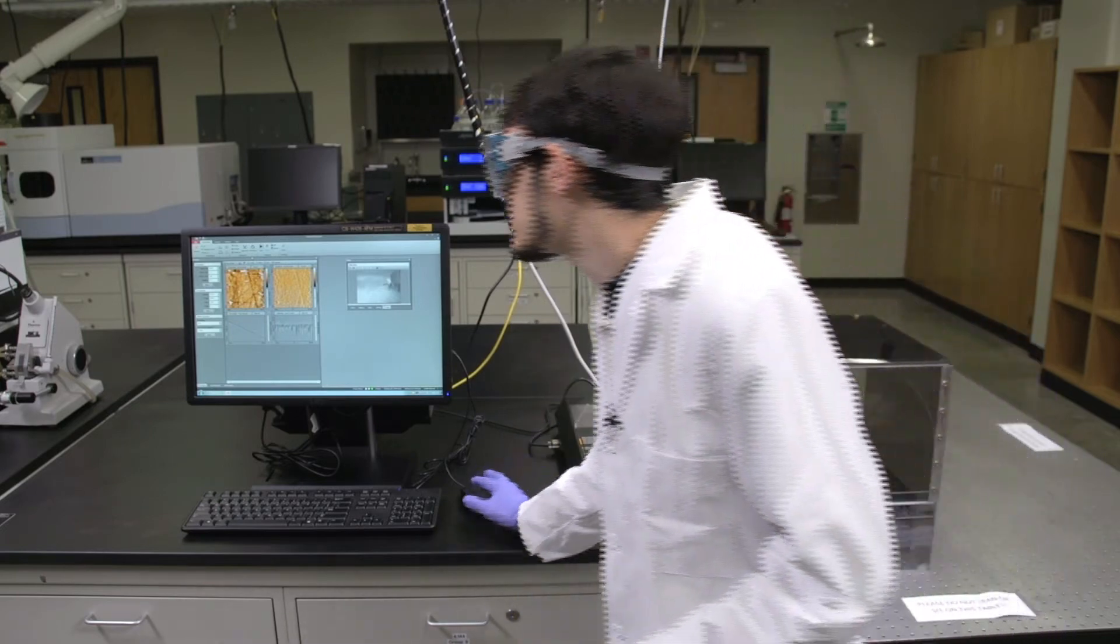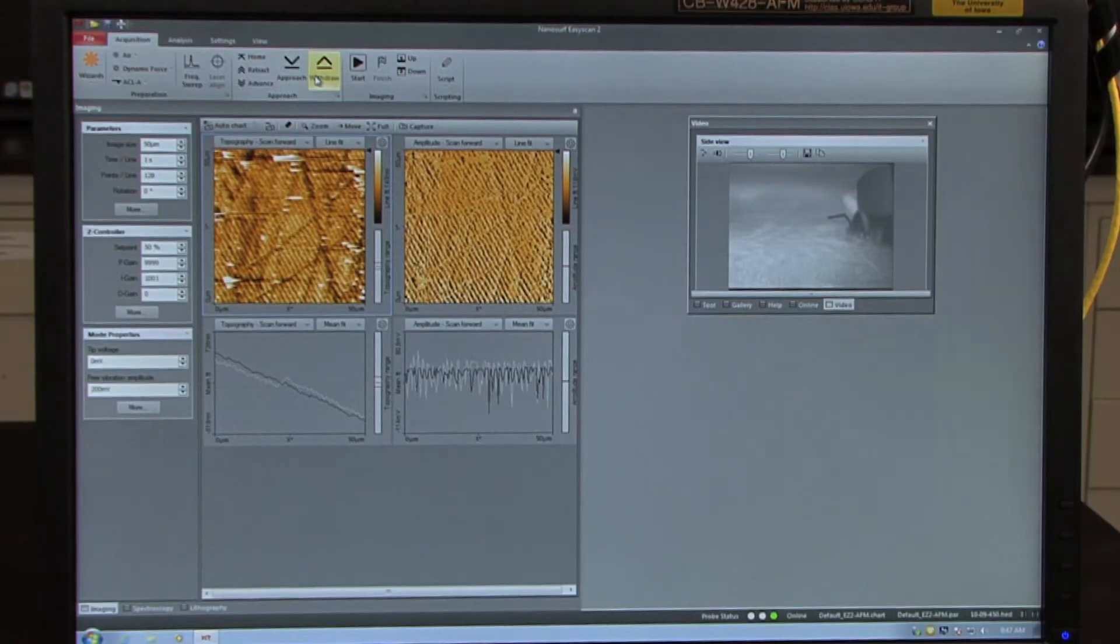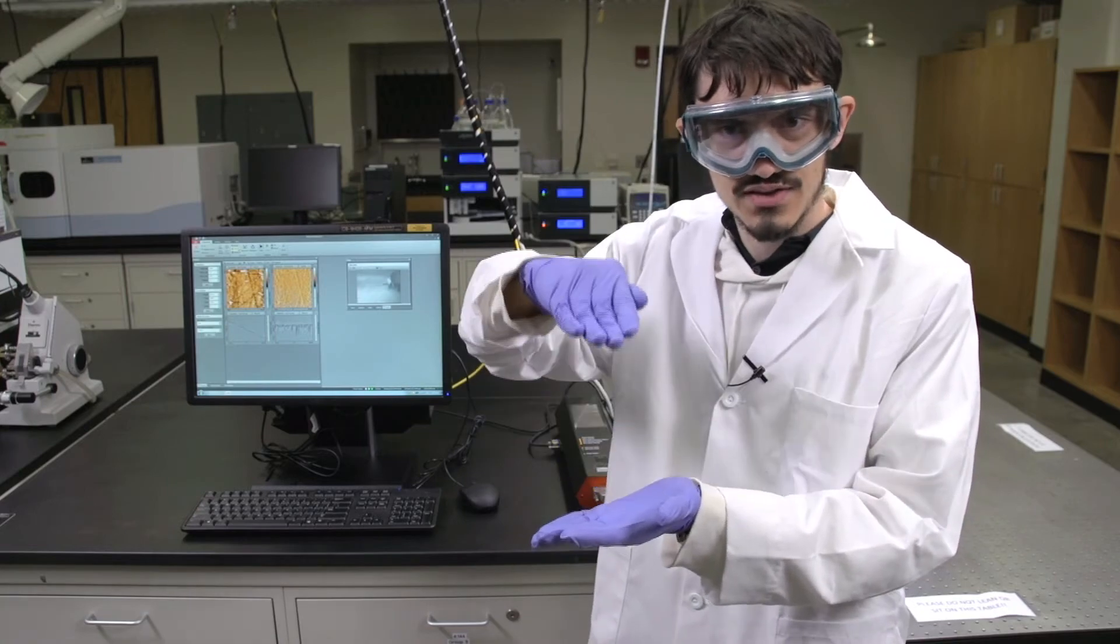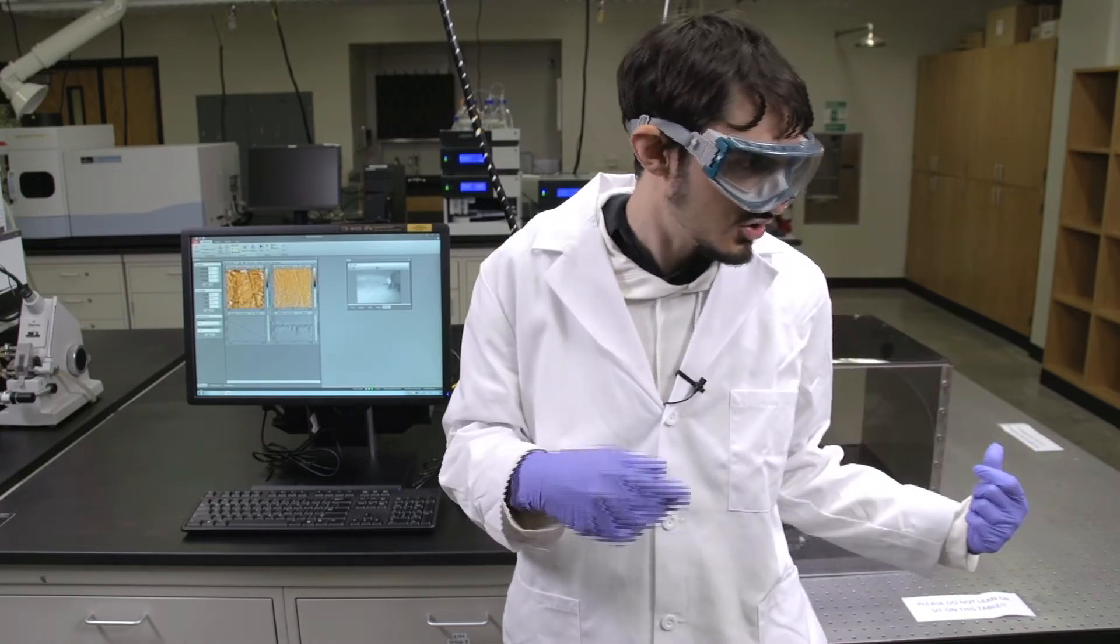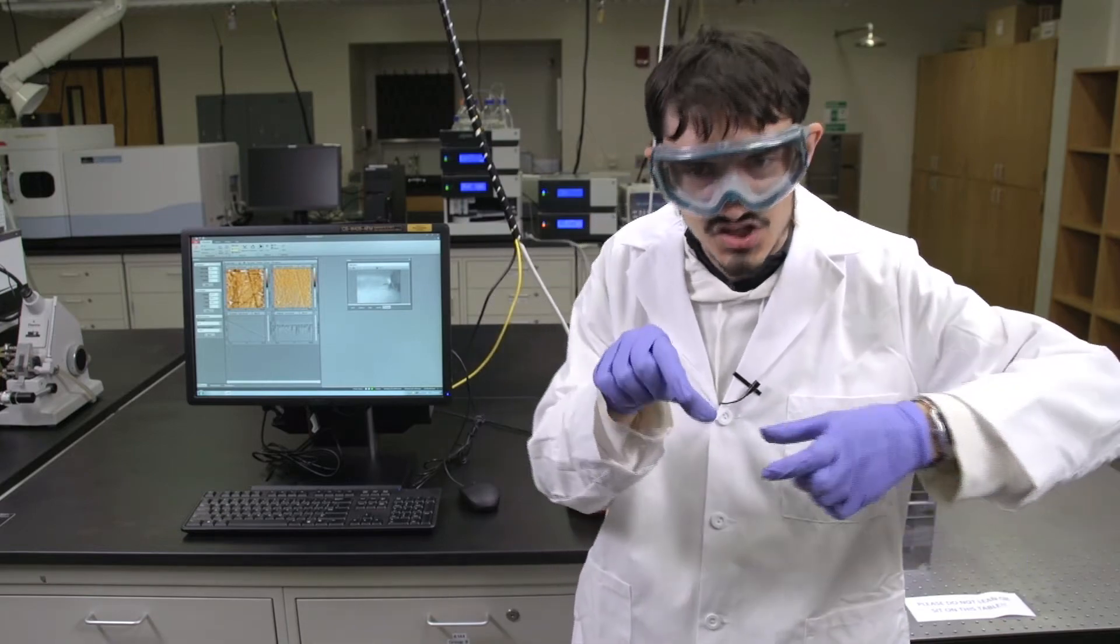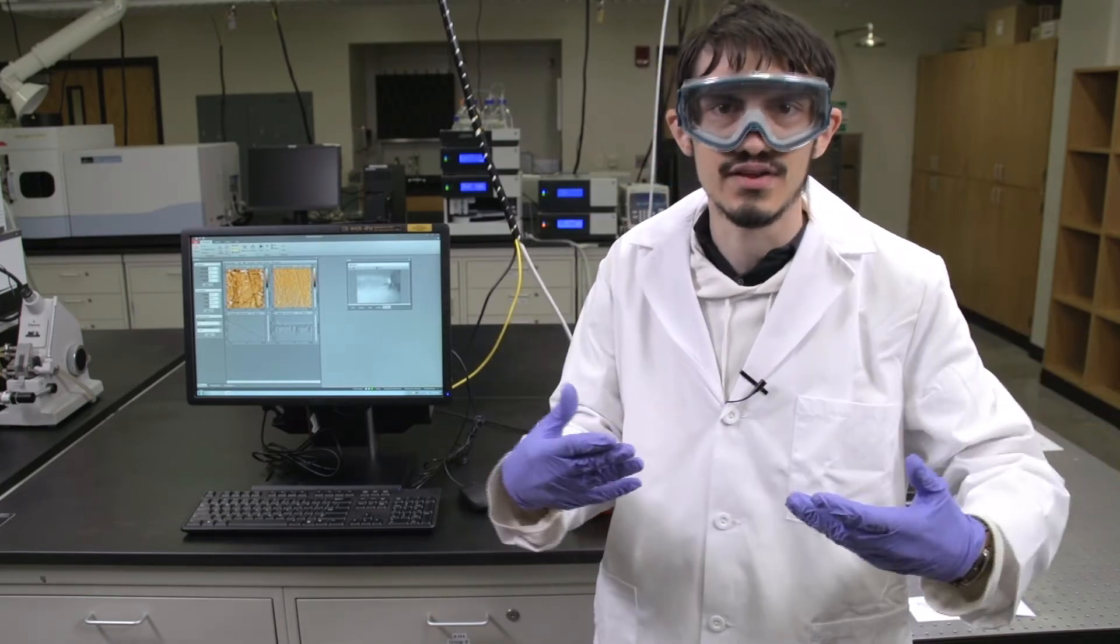In order to do this, you'll need to click withdraw, and then you'll need to click and hold retract in order to make sure that the tip is significantly away from the slide itself before you or your lab partner pull out the actual stage and reposition the slide under the head.